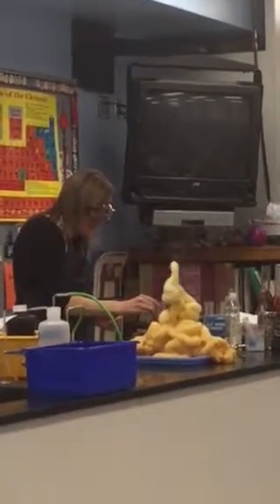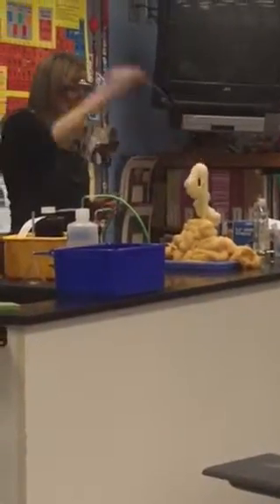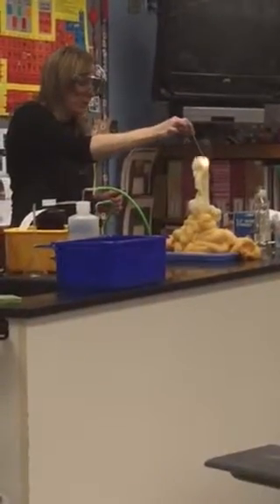See the steam, you guys? Signs of reaction here. That is so cool! Okay, now we got this burning splint. Positive test for oxygen gas, right? The splint will relight. Let's see if I can actually get it to go in there. It's coming out pretty darn fast. I don't know if I'll be able to.